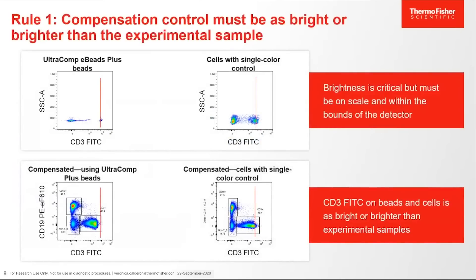Rule 1: compensation control must be as bright or brighter than the experimental sample. These plots give a visual representation of Rule 1. Ultracomp eBeads Plus in the upper left and cells in the upper right are stained with CD3 FITC. Brightness is critical but must be on scale and within the bounds of the detector. The red line represents how the CD3 FITC antibody signal on the beads or on the cells is as bright or brighter than the experimental sample.